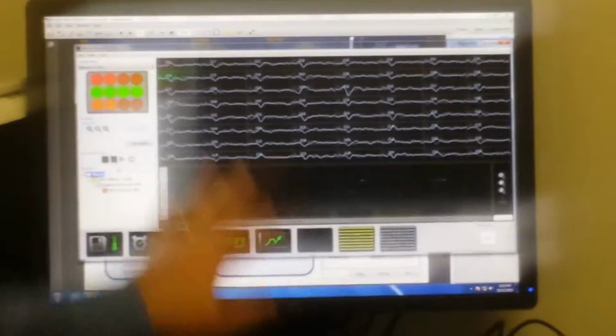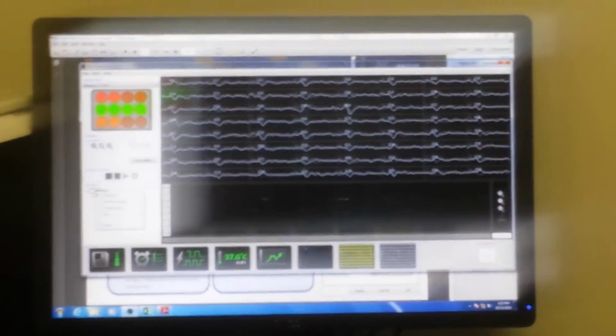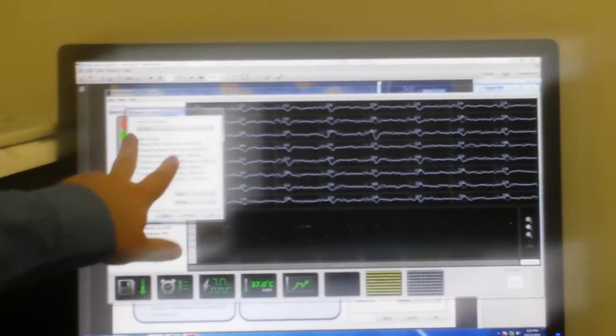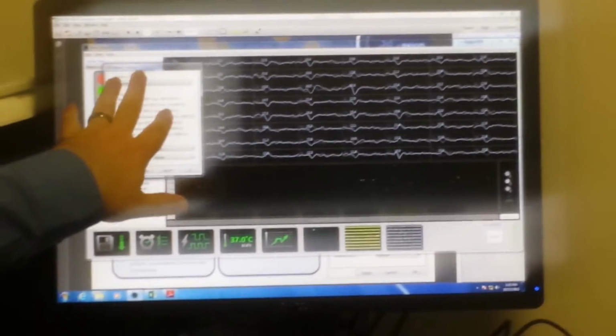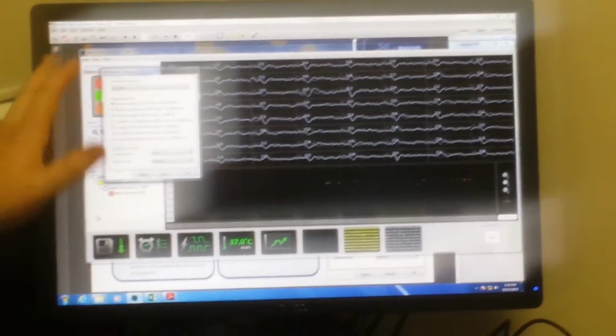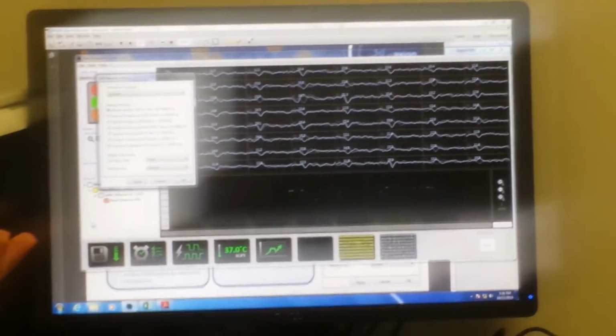And with Axis, anything you double click on is going to bring up the settings. So double click on the Maestro. You can also right click and get there. It depends on if you're in a rush or not. The only settings that really can't be adjusted after they're recorded are the Maestro settings. So those are hardware settings, and they influence how the data is acquired.